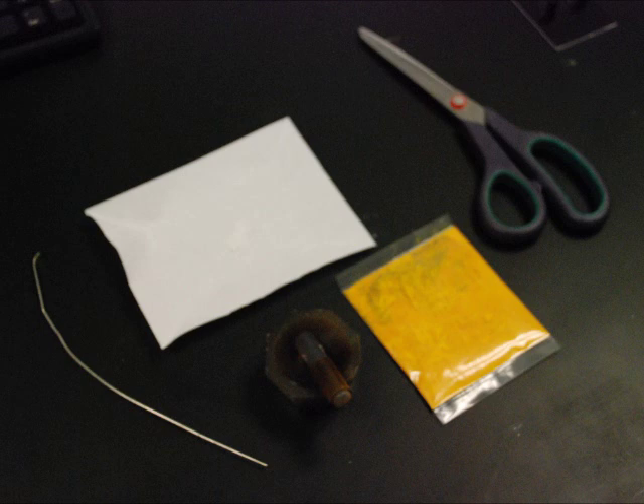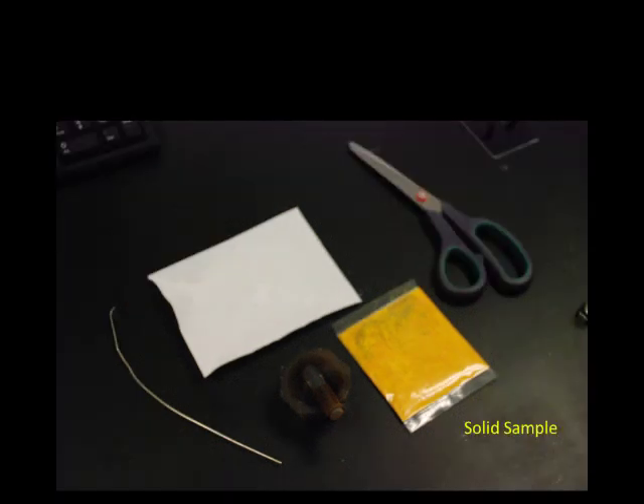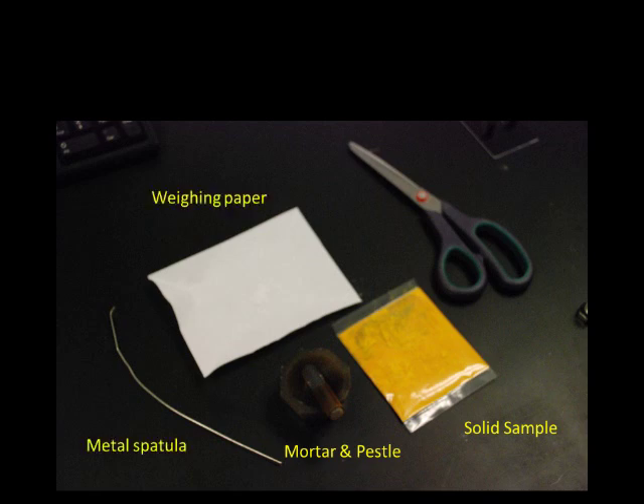You will need the following equipment: the solid sample, a mortar and pestle set, a metal spatula, and a piece of weighing paper.